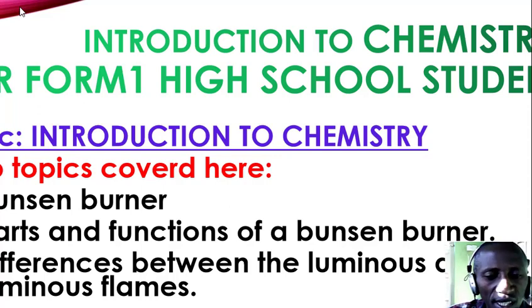Straight to today's lesson, Introduction to Chemistry for Form 1. We look at topic number 1, Introduction to Chemistry. The subtopic is the Bunsen burner, the parts of a Bunsen burner and the differences between luminous and non-luminous flames.